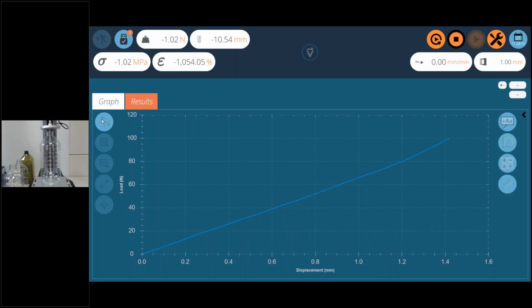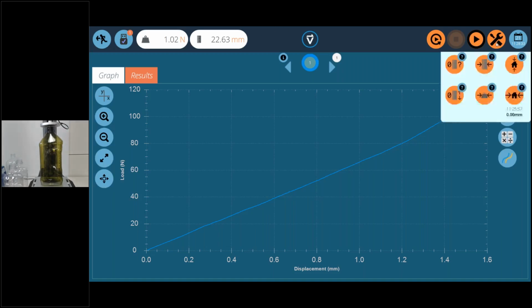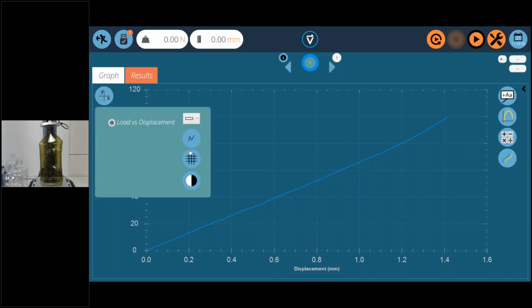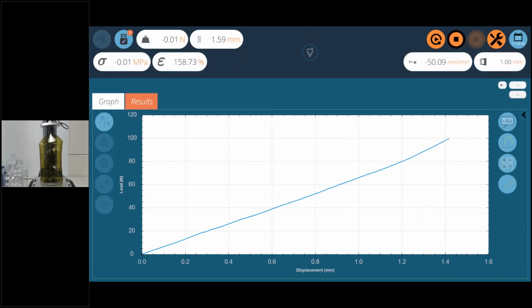All right. Once again, I'm going to run a second test, and I'm going to do this on a different container as well, so we can have a quick idea of what, especially when you're doing a comparative analysis, you can mix and match what your containers look like. So again, set a home position for this because it's slightly a different home position. Change our contrast one more time and run. Let's touch.